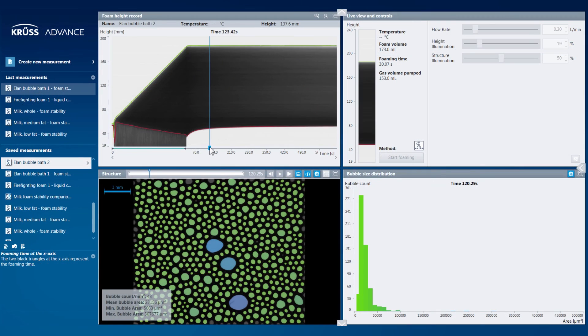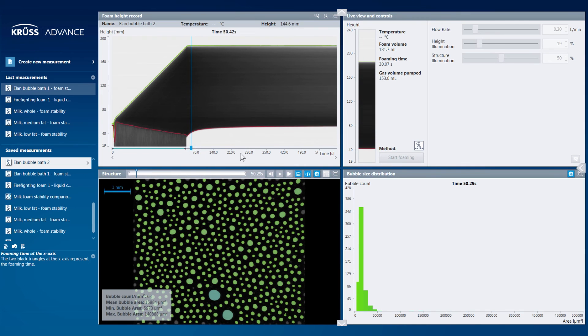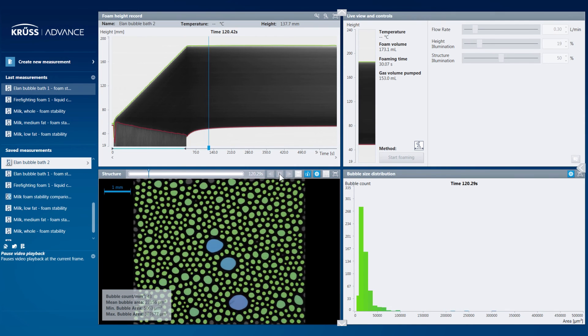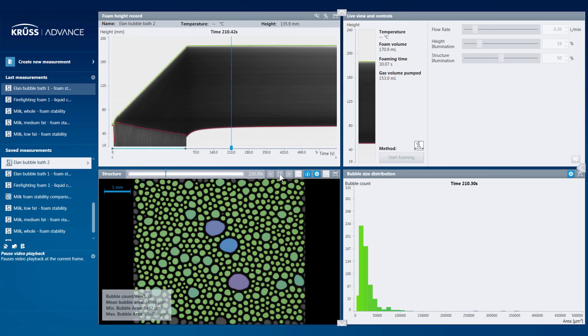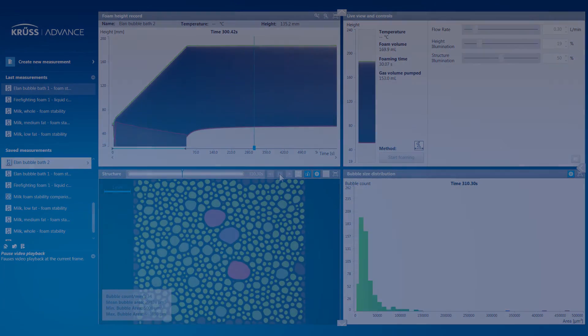Advance's templates are a powerful tool to enhance the speed, ease, and reproducibility of your surface science measurements.